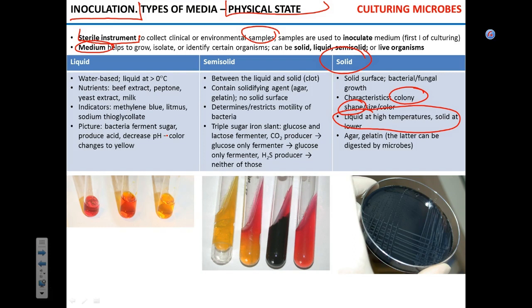And you can pour it in the plates, and it'll become solid. This is really convenient because you can boil the agar, and when it cools down, first of all, you can autoclave it. You can sterilize it. Does that make sense? And then when it cools down, you can add to it certain chemicals that can't be heated.